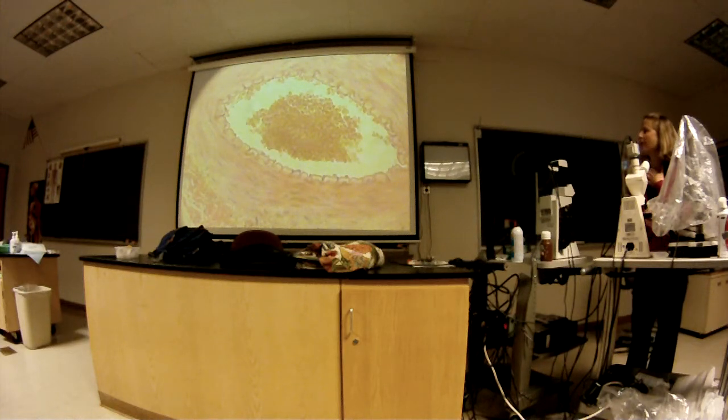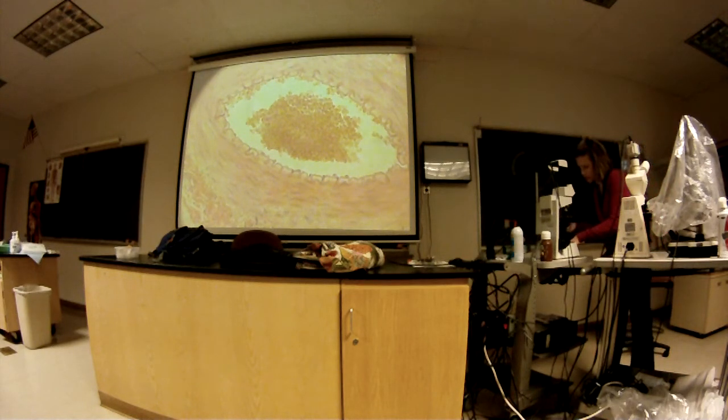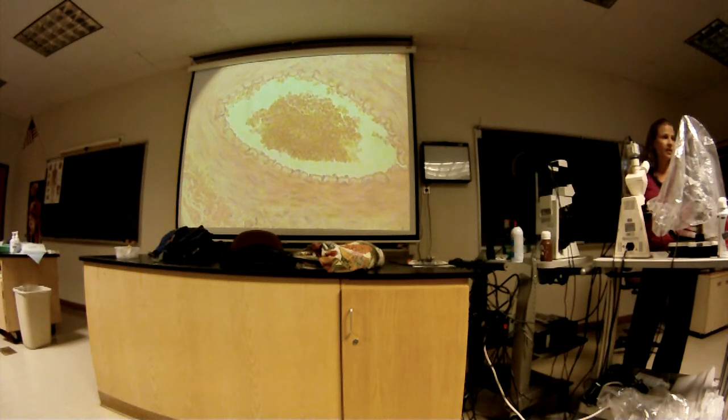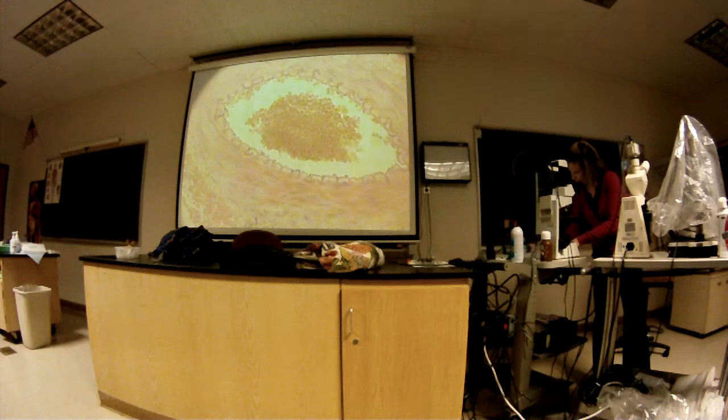Same thing, yeah. And so a different question, what kind of epithelium is found here? Simple squamous, yeah. And its name is the endothelium. I see on your list it says endothelium. You should know that that's simple squamous. The name of that layer is endothelium. That's what it's called. The lining of blood vessels is called the endothelium. For the adventitia or the tunica externa, it doesn't matter which, either one, right? Yep.